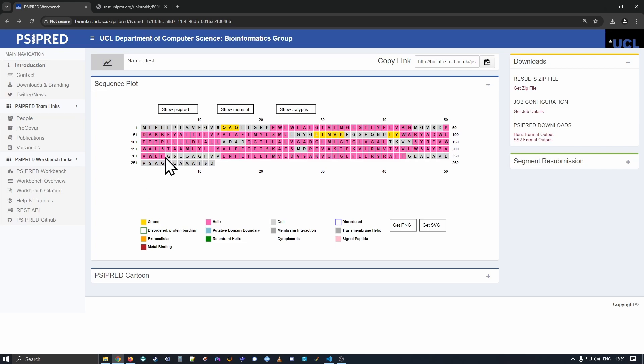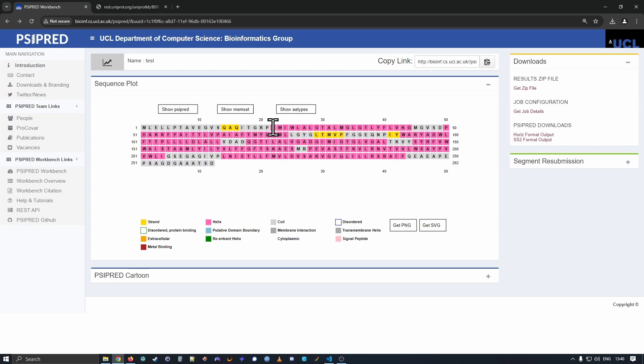Cypred annotates things with secondary structure. So here, looking down on the key, the secondary structure elements are beta strand in yellow, alpha helix in pink and coil in light gray. Looking up at the sequence, we can see the different residues have been colored accordingly.